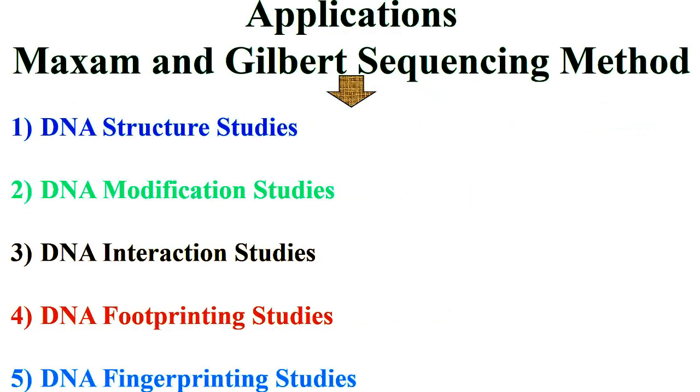Finally, Maxam-Gilbert sequencing method. Use in DNA structure studies, and DNA modification studies, and DNA interaction studies, and DNA footprinting studies, and DNA fingerprinting studies.